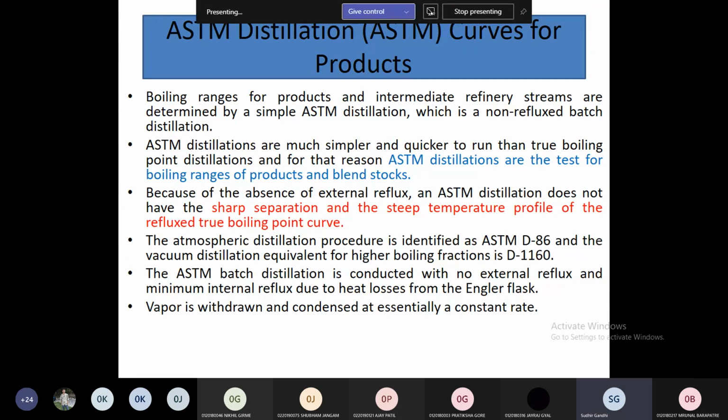So when it comes to heavier fraction analysis, gasoline analysis, kerosene analysis, and characterization of that, whether it is blended with some higher fractions or added with some unwanted ingredients, then this is a test which plays a very important role. So I used to do this test. Just to give you an idea, we received a sample from one petrol pump.